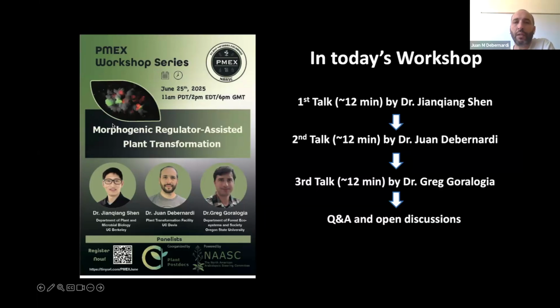I think the answer depends a lot on the crop. For example, in our case in wheat and barley, the explant, the immature embryo, makes a little bit of callus but immediately produces somatic embryos. So there is no long callus induction phase, which I don't like, because keeping the material in callus induction for a long time can also induce a lot of somaclonal variation.